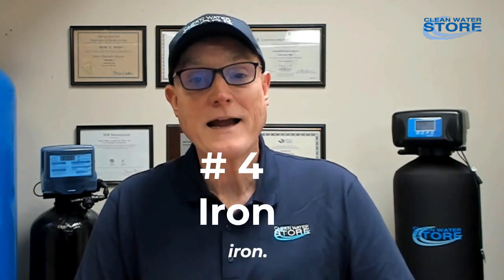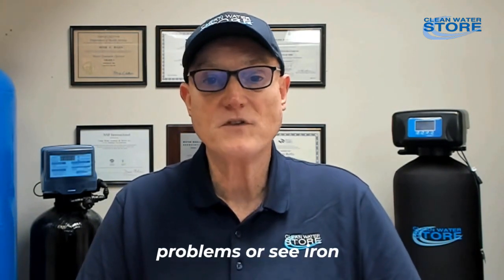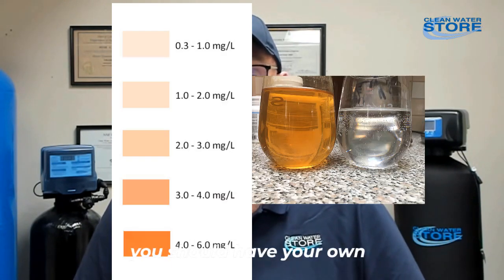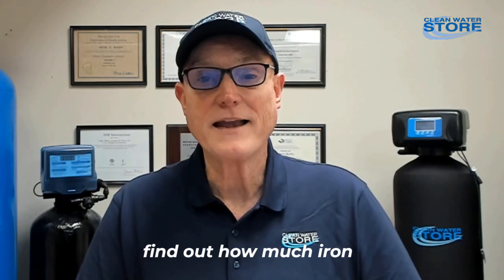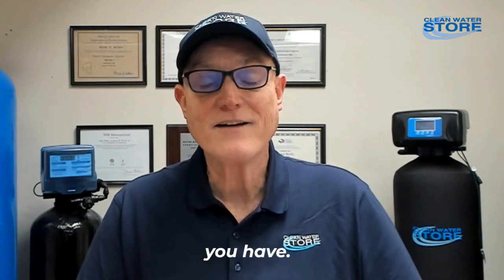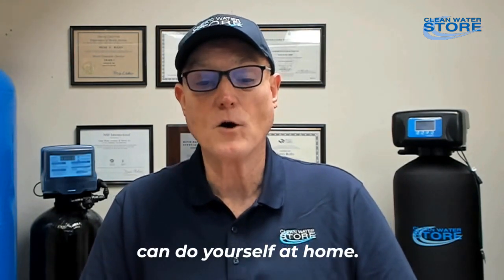Number four: iron. Iron is another good one to test at home. If you have rust problems or see iron stains, you should have your own iron test kit. It's an inexpensive way to find out how much iron you have, whether you need an iron filter, and to continually test before and after your iron filter system.